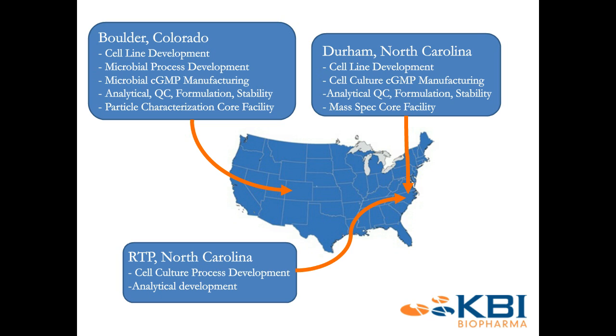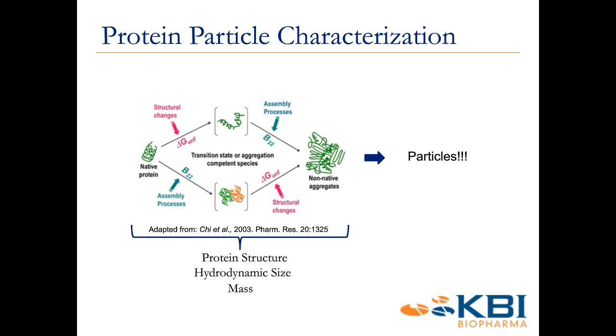But back to the more interesting stuff, particle characterization. As I mentioned, one of our fortes is looking at particles in pharmaceutical products. And when we're talking mostly about biologics here, we have a lot of experience looking at proteins and how they degrade and how they could form non-native aggregates or oligomers that could agglomerate and eventually form particles in products.